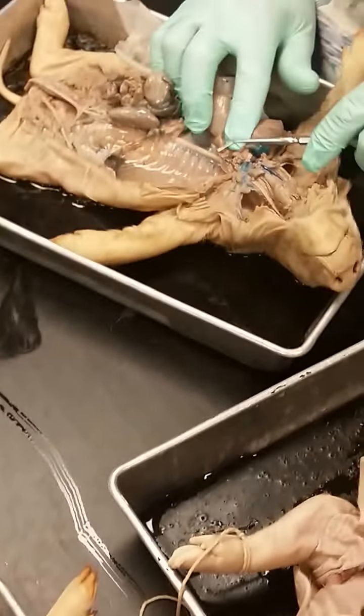And then of course right under the stomach, you see this rather diffuse organ right there, kind of a brown color. Pancreas? That would be the pancreas right there. You can see how kind of lumpy, but it's not a real defined organ. It's kind of spread out. Okay? And of course the head of it would be located to the duodenum right there.